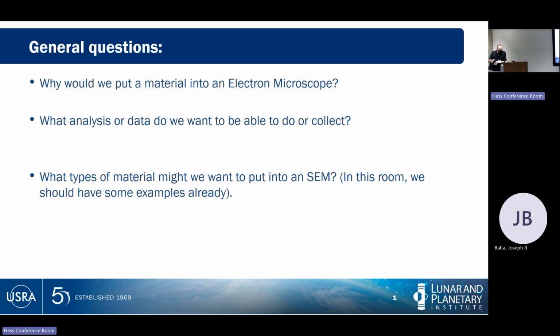And they've taken this material, reacted it with water, reacted it with ammonia, scraped off the solid components, and so they have the in-solution components. They're going to precipitate that out, and that's presumably going to give us something like a precipitated, sugar-like structure or something along those lines.